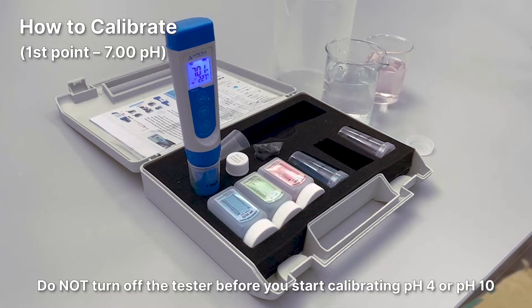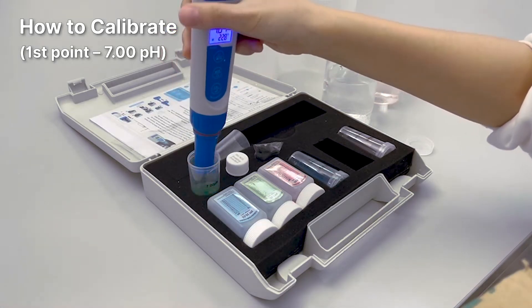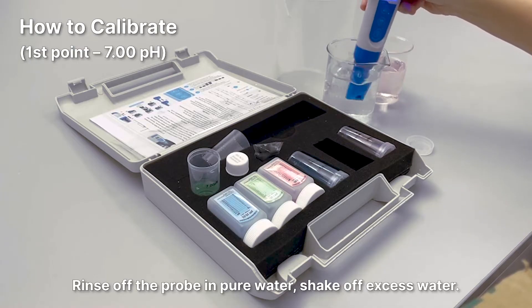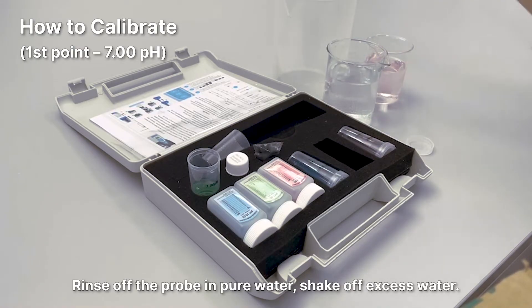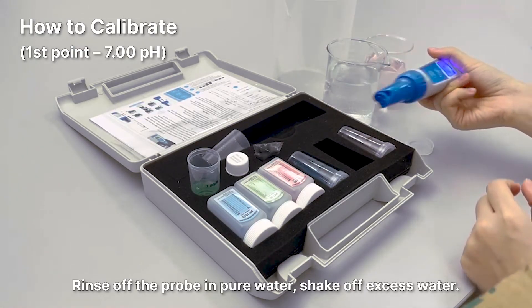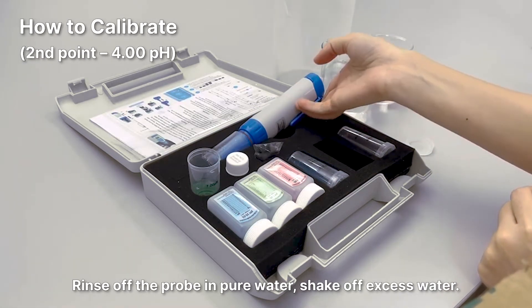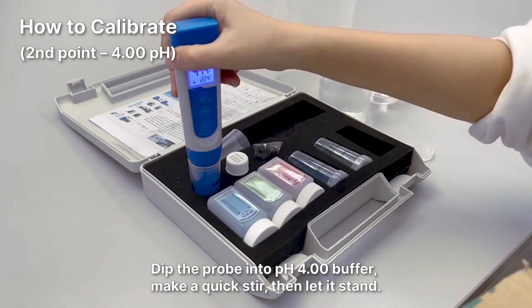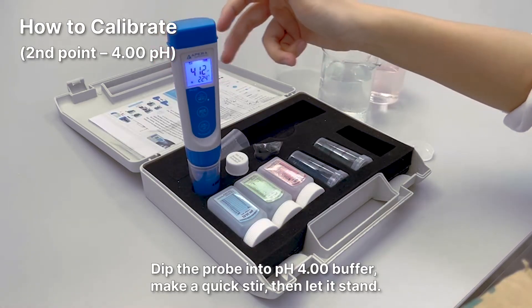Do not turn off the tester before you start calibrating pH 4 or pH 10. Rinse off the probe in pure water and shake off excess water. To calibrate the second point, dip the probe in the pH 4.00 buffer, make a quick stir, then let it stand.